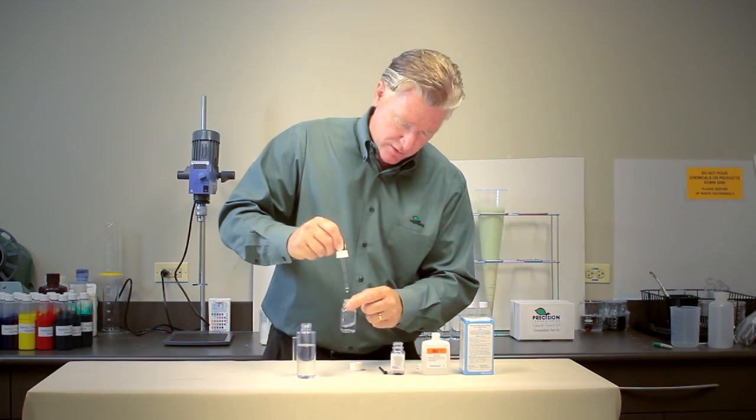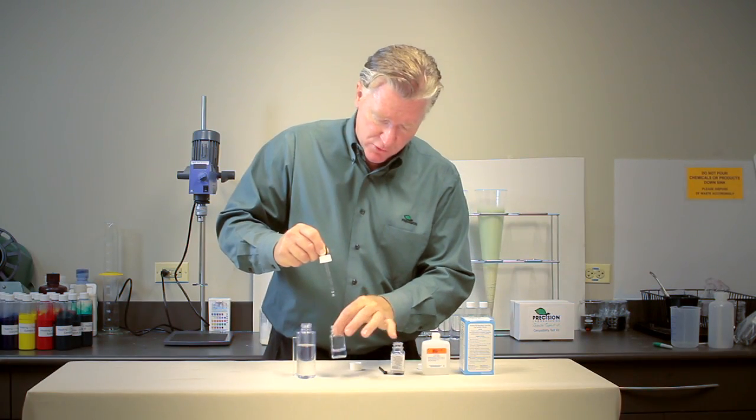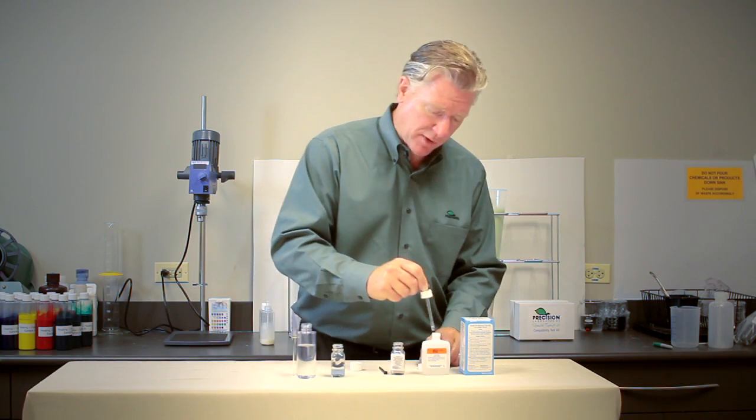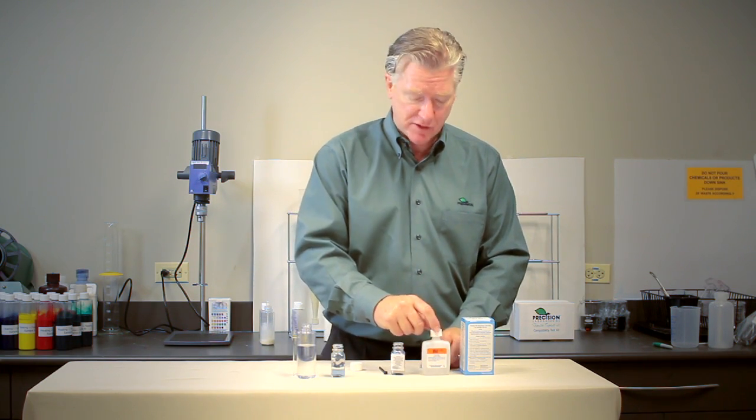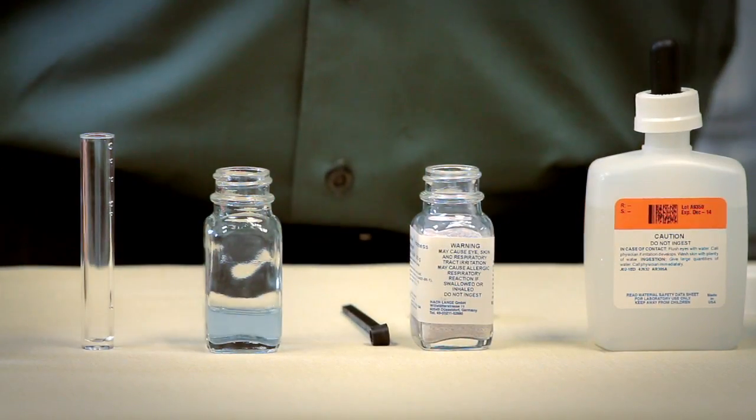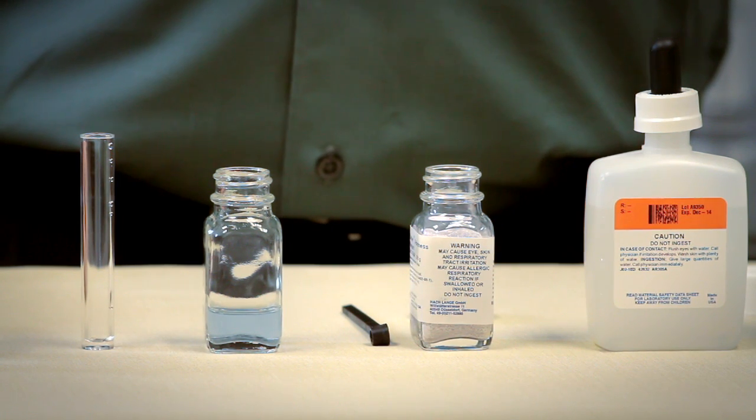19, 20, and there you go. 20 to 21 drops or about 340 to 357 parts per million. So this is pretty hard water and really would be problematic for glyphosate.